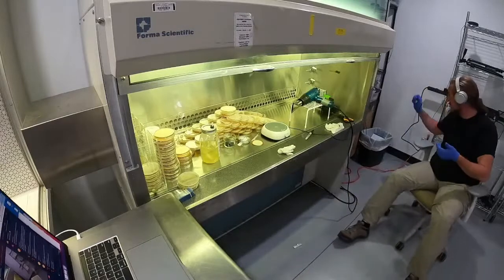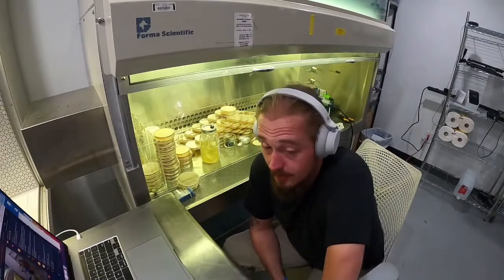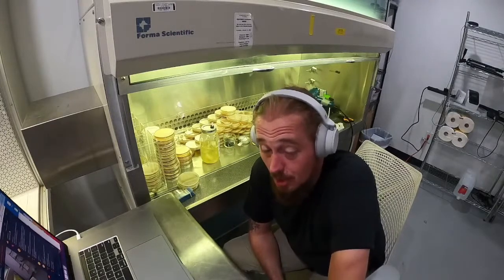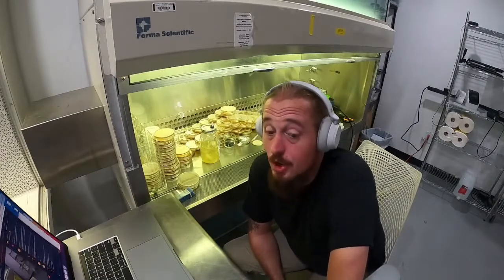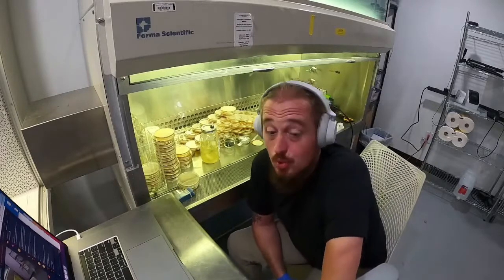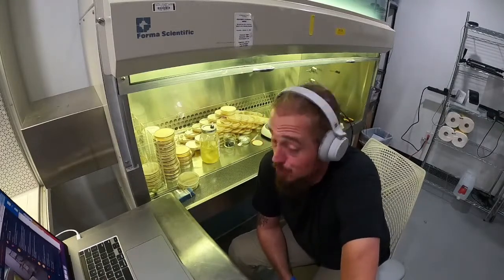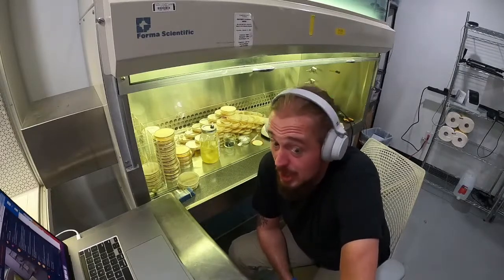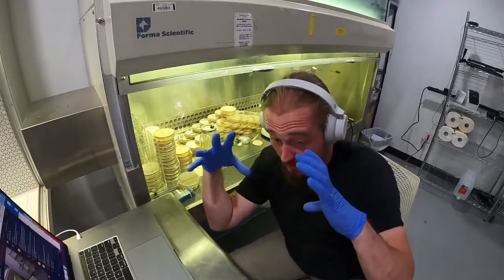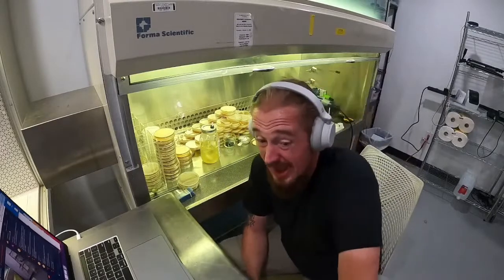Yep, black mold. So black mold is a bitch. This is why I'm going to give you pro tip number 432. Go and get yourself a HEPA air filter for a house, right? Go to Amazon, spend about 100 to 150 bucks. Go and get a home 99% pure HEPA filter for your house. Put that in your brooding chamber, put that in your myco space. In other words, your incubator, your clean room space, and things like that. You really want to put a HEPA filter in there. And the reason why is because stuff like black mold will pass through those filter patches no matter what you do. Right. Because it can have a really, really small particle size. So we actually have HEPA filters in everything. I've got these little $50 HEPA filters I put in the spawn chamber, the fruiting block chamber, and the fruiting chamber. Then, of course, we've got our HEPA filters here. Right. So air is your enemy.